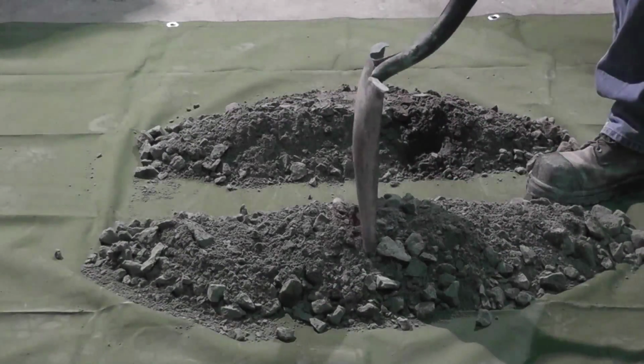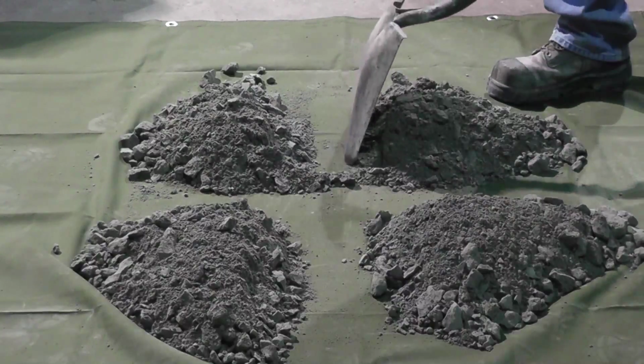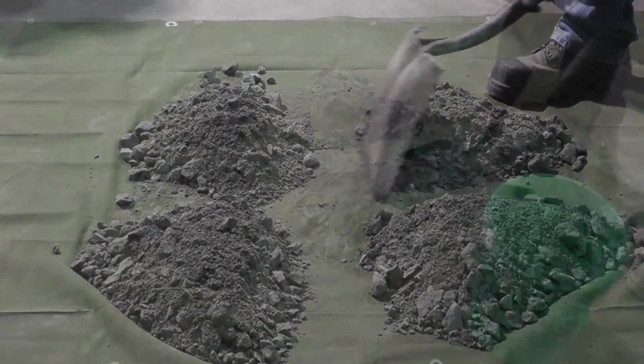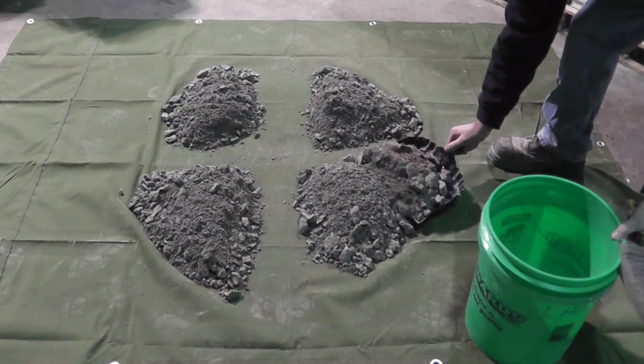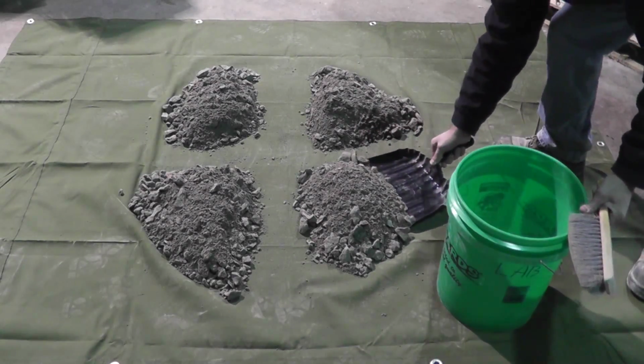Divide the flattened pile into 4 equal quarters with the shovel or trowel. Remove 2 diagonally opposite quarters, including all fine material.